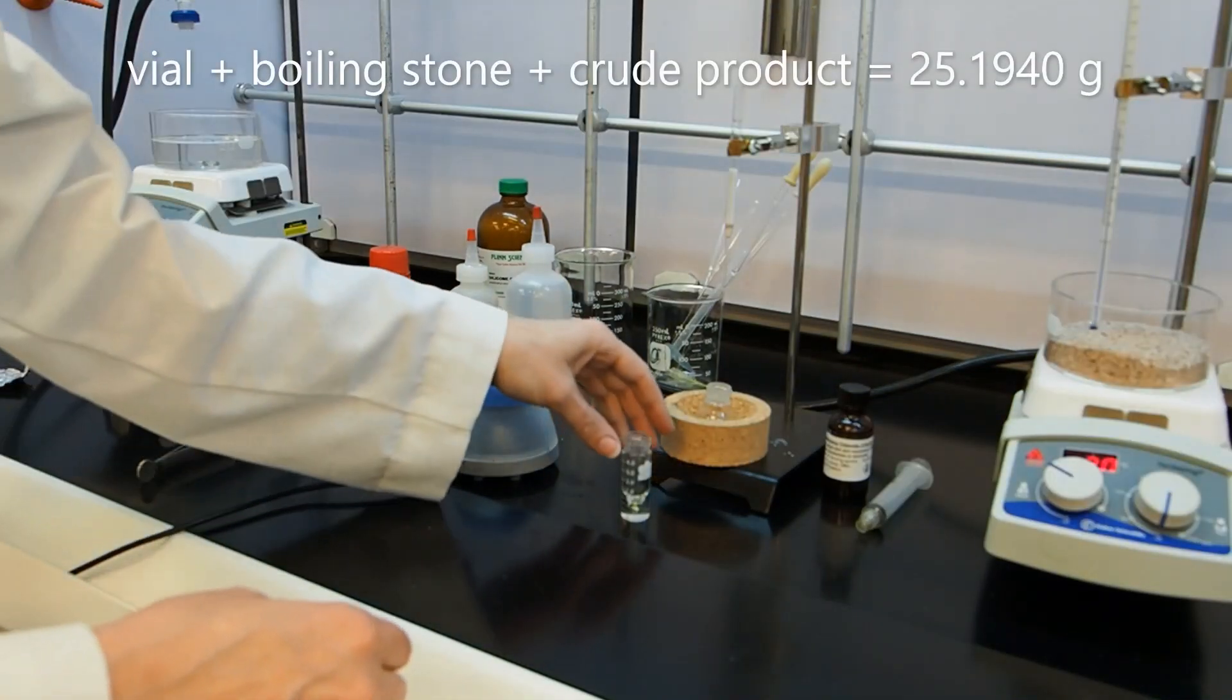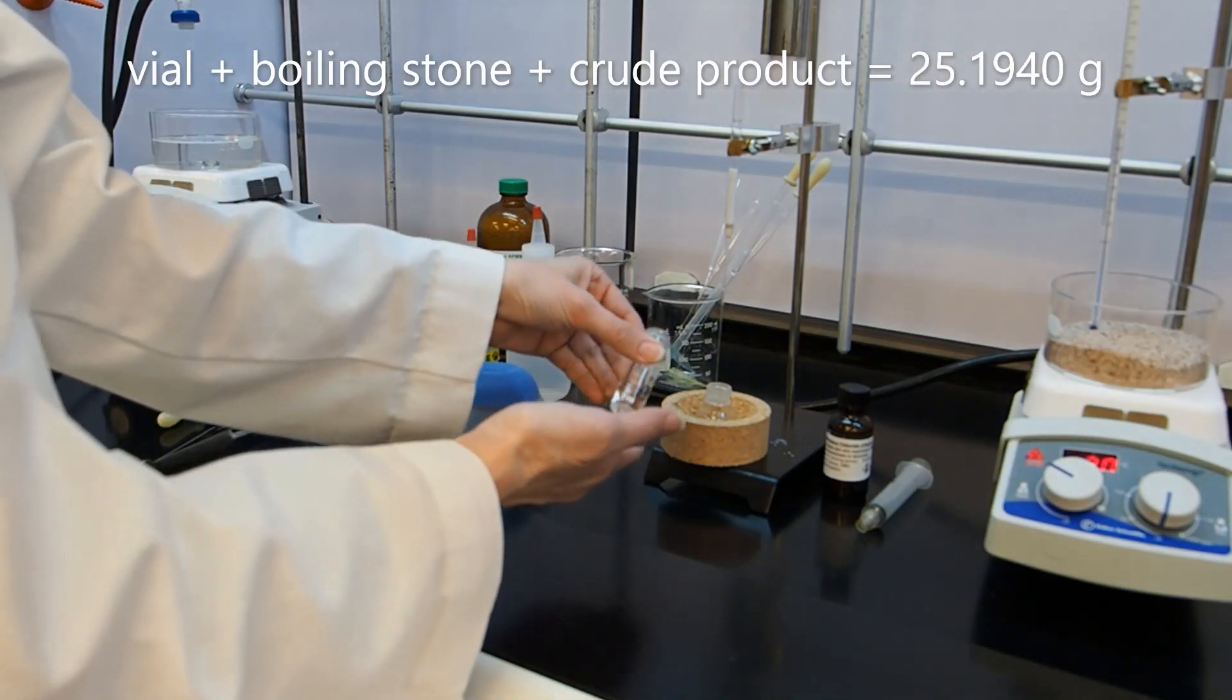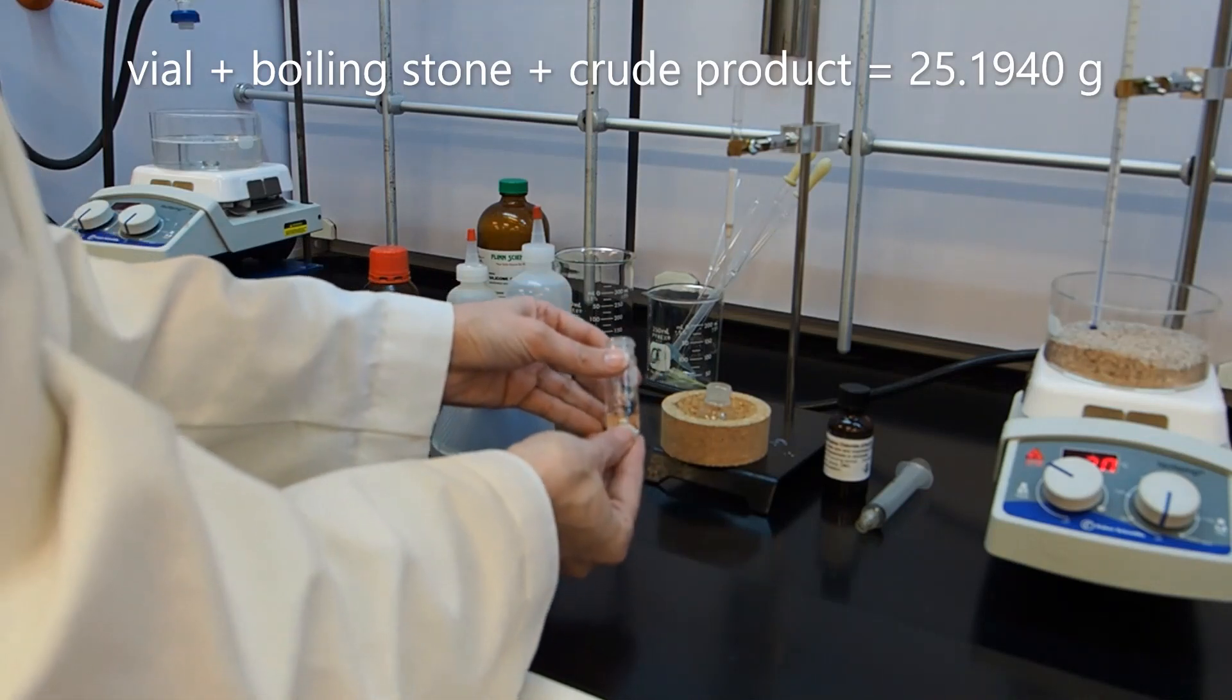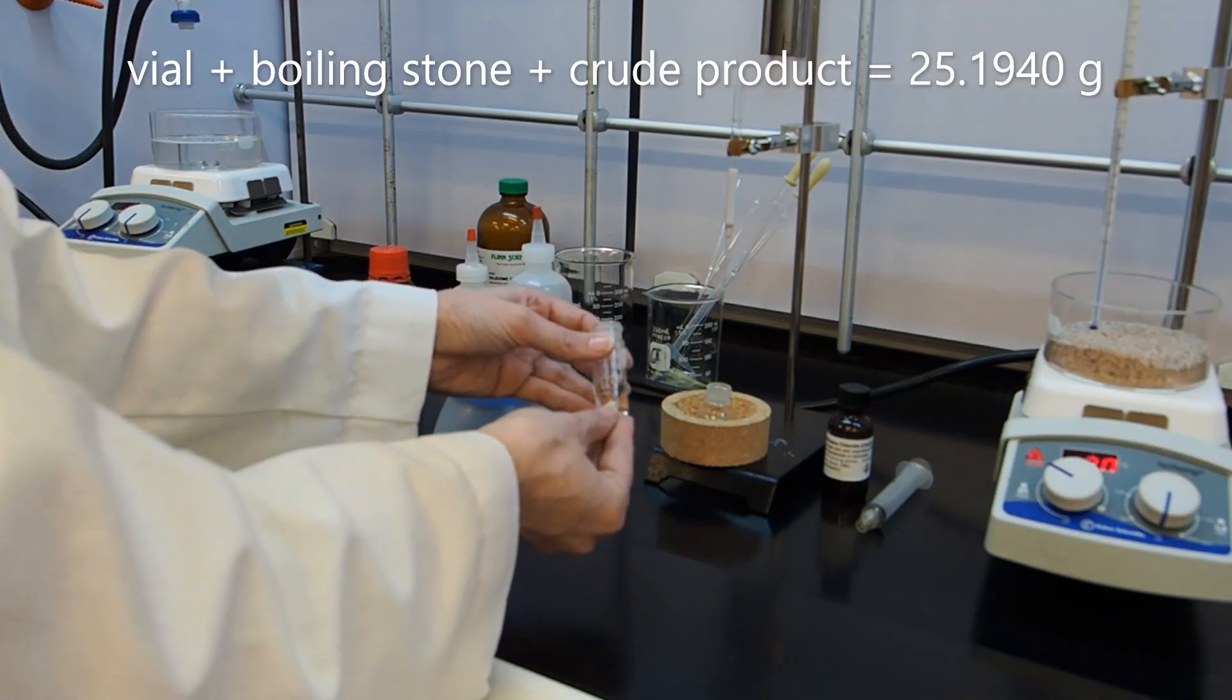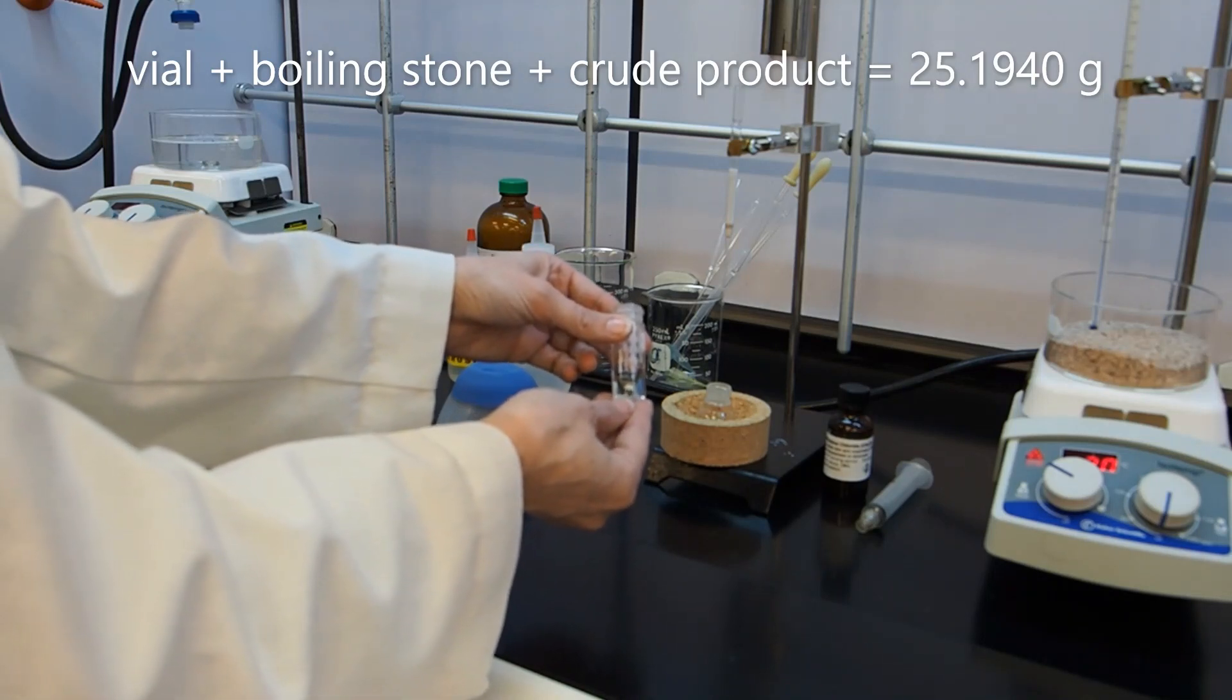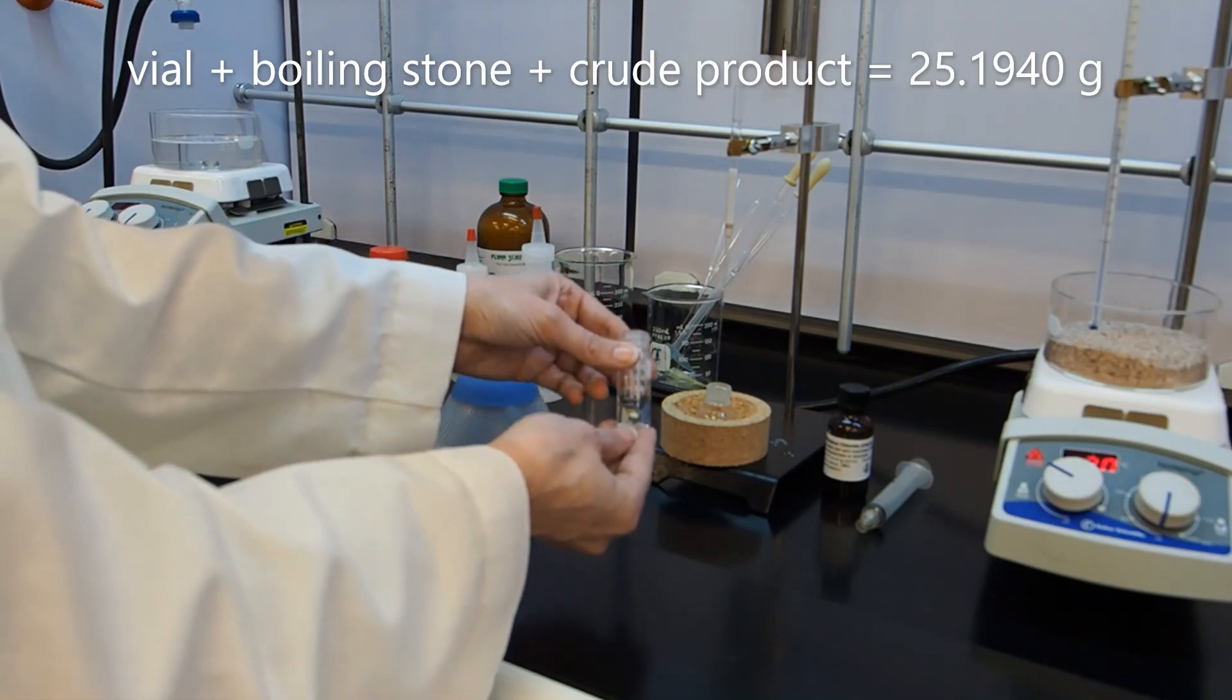So I have evaporated all of the ether and gotten my crude product. The weight of the vial plus the boiling stone plus the crude product is 25.1940 grams.